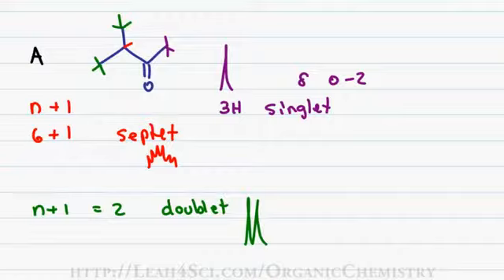However, this will likely be the most exciting group on the molecule, given how many different groups are next to it. So we'll write high between 0 and 3. And finally, for the doublet, given that it's at the end of the molecule, but it's next to another carbon with a hydrogen neighbor, we'll also keep it on the boring region and say the shift is approximately 0 to 2.